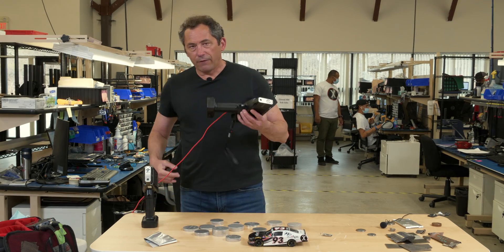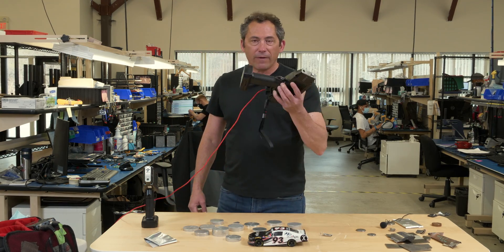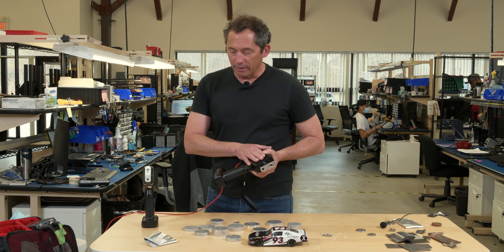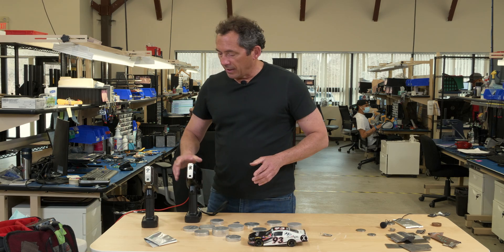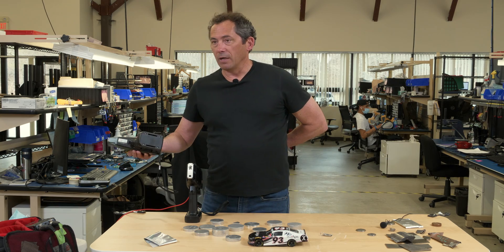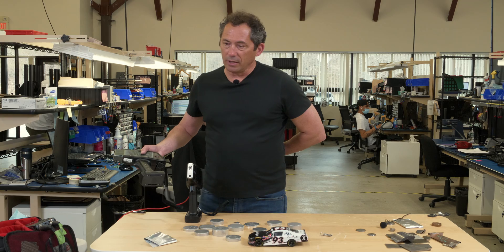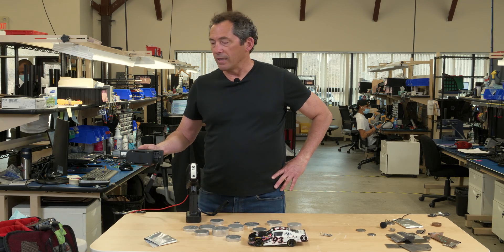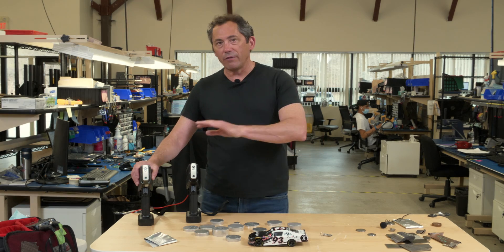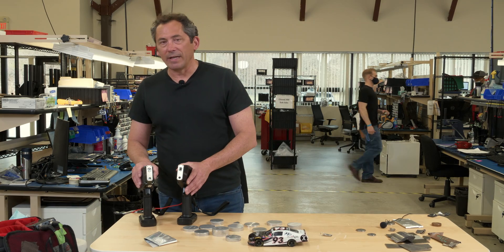To summarize: if you want blistering speed and the best possible accuracy on the widest range of aluminum alloys, you want the X-550, the premium model alloy sorter. We've got that patented aluminum app — there's nothing else like it on the market. If you're not doing tons and tons of aluminum a day, the X-505 will be a great choice — it's a couple thousand dollars less expensive. You can do your easy grades in one or two seconds and your harder grades in about four or five seconds. Both work great in high temps, stainless, red metals, turnings, specialty alloys, tungsten carbides — everything. But we've really invested a lot in making aluminum as good on x-ray as stainless and high temps.